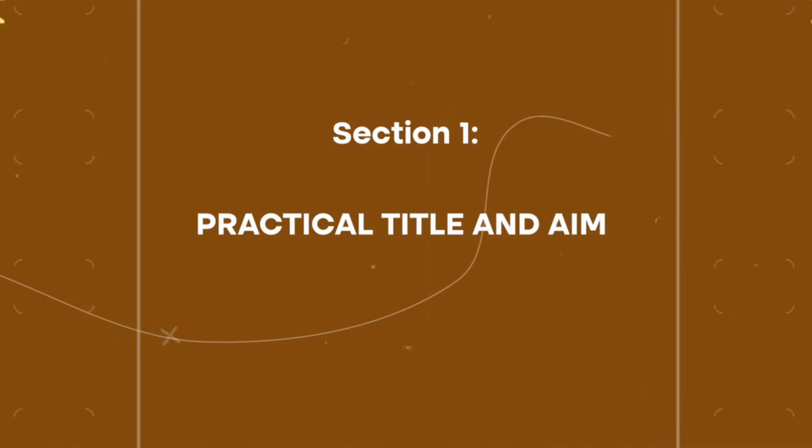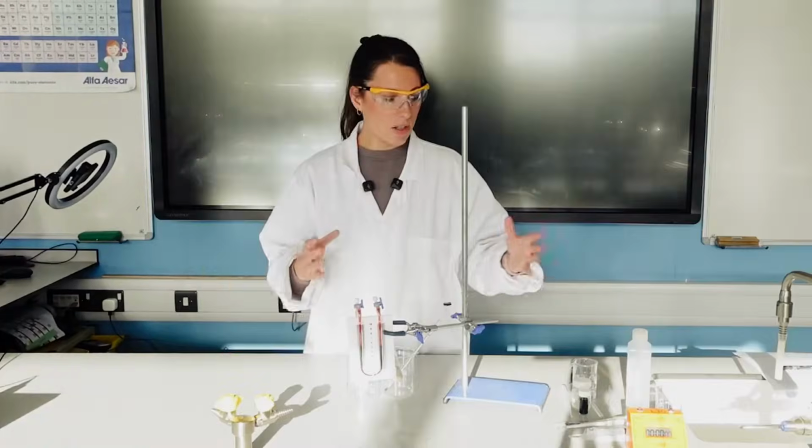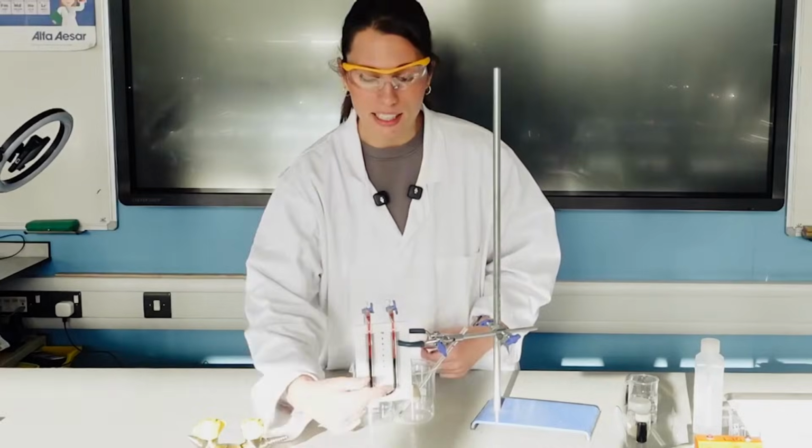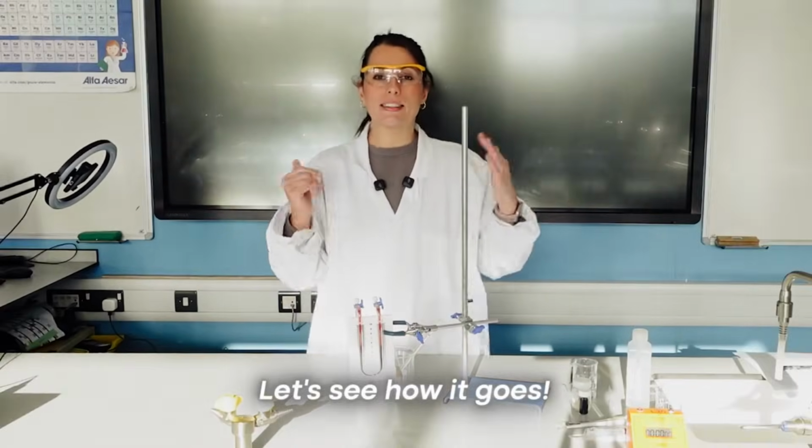Now this practical itself isn't actually very complicated. It's quite easy for students to do. However, it notoriously doesn't work. So I'm going to be very surprised if I manage to get this to work today and we do actually see any coloured liquid move, but fingers crossed, let's see how it goes.